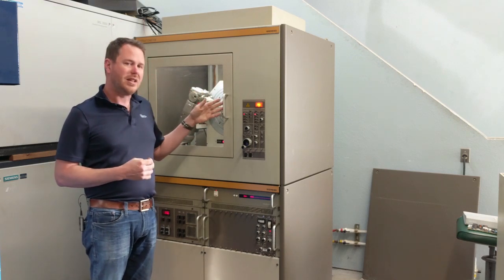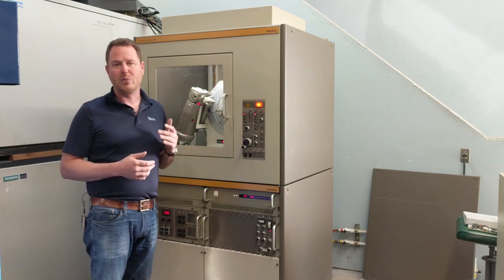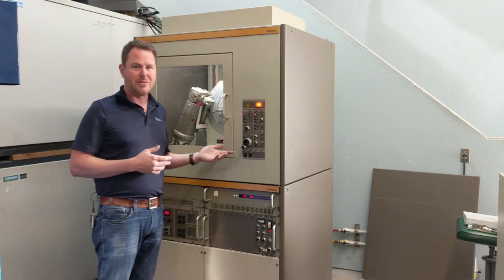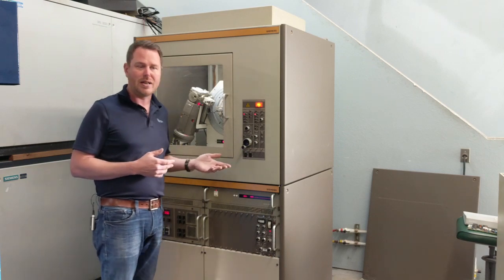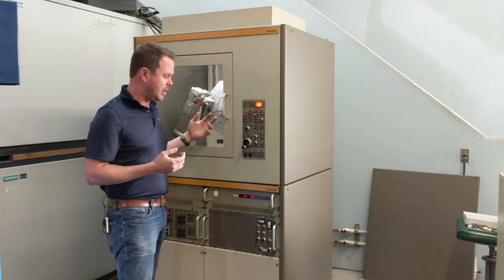The only real detriment to the D500 is that it's not nearly as fast as the newest systems with their position-sensitive detectors. Now those detectors also have their caveats, things to watch out for. But the D500 fares very well by comparison.